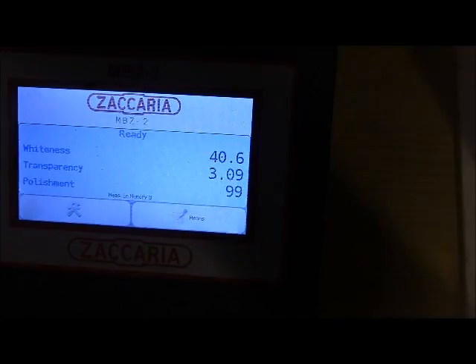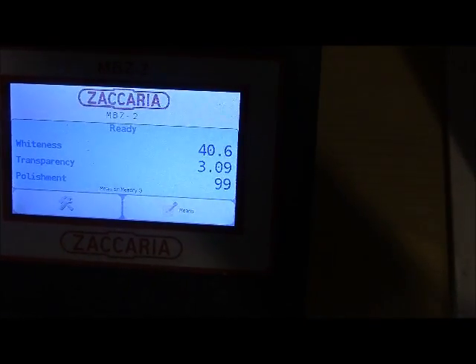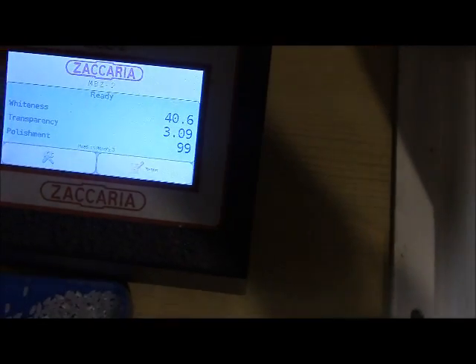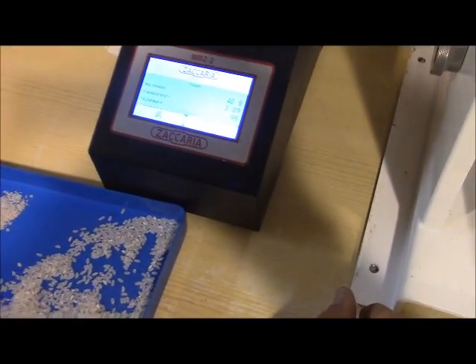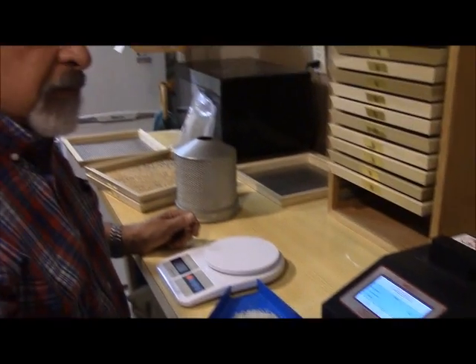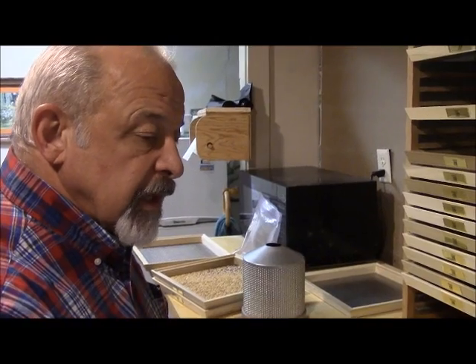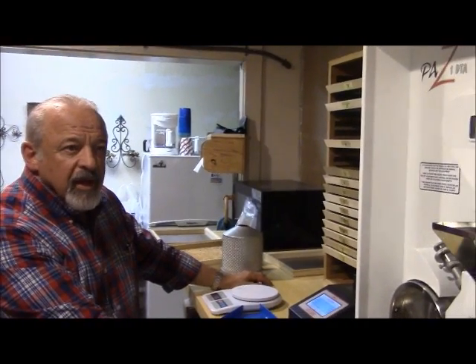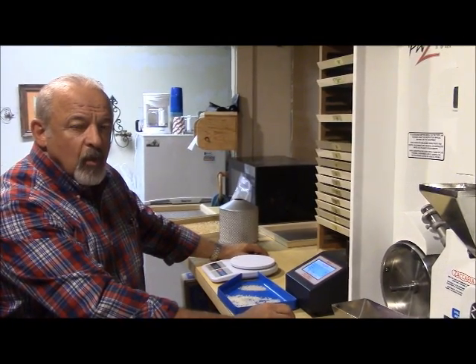There you have it: 40.6. 40 is the international standard. Anything close to 100 is quite an acceptable value for each of those. So there you have it — a test of the Calrose variety 2014 on the PAZ1 and MBZ2 whiteness meter.